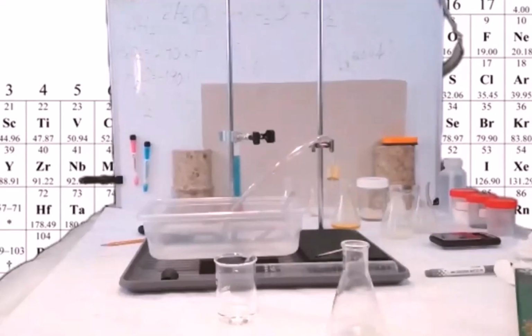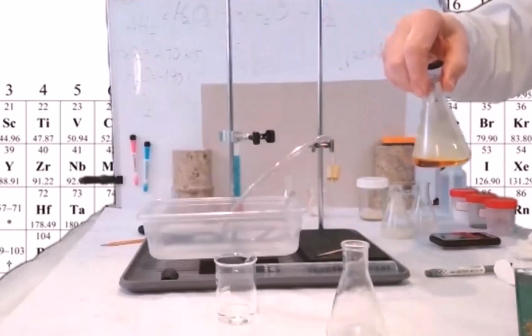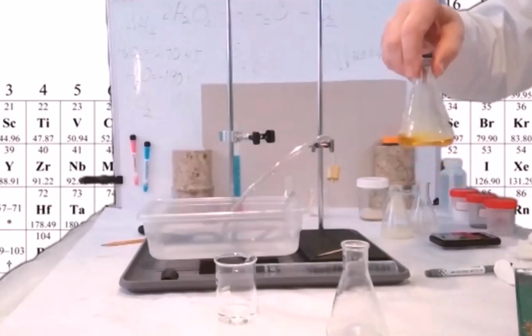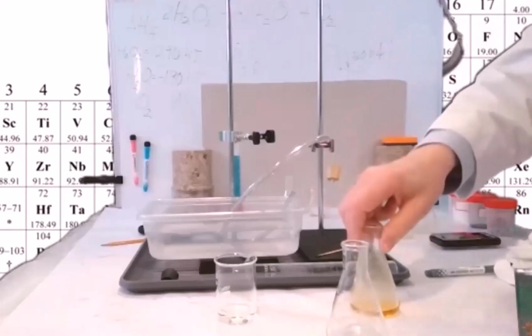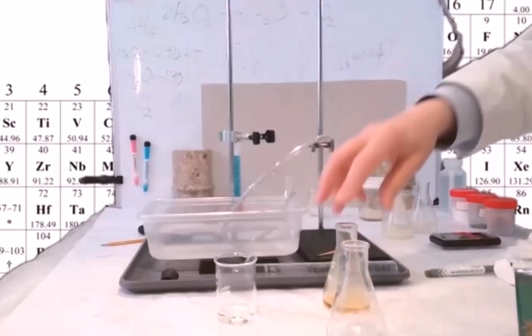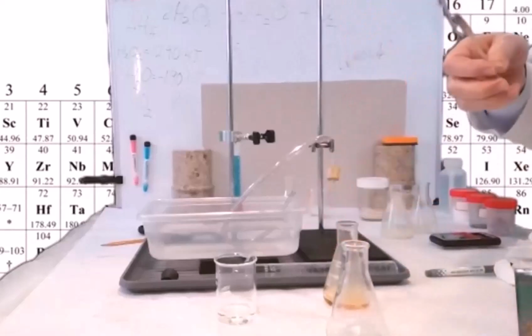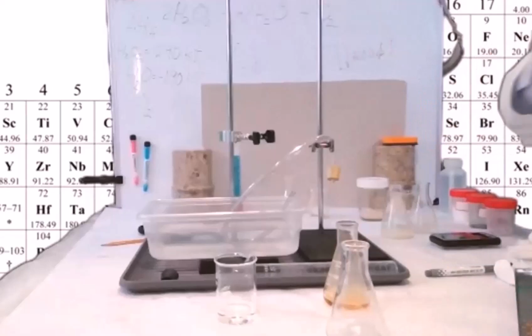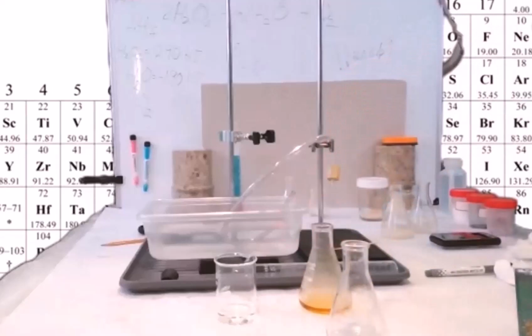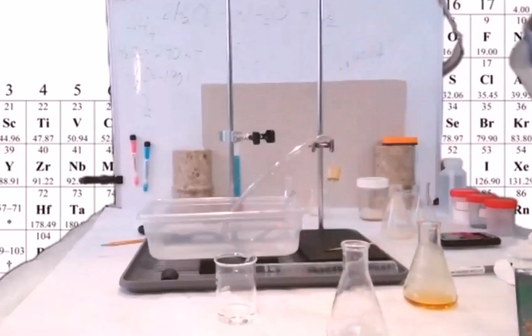When I had air in this flask, the partial pressure of oxygen probably was about 0.2 of an atmosphere. So when that splint was trying to glow, 4 out of 5 times it got some nitrogen. But in this flask, which had pure oxygen in it, all the collisions could have been with oxygen because the partial pressure of oxygen, this is pure, would be 1 atmosphere. And as a result, a glowing splint bursts into flame. So in a pure oxygen environment, if you've got something that's glowing, you're going to be in trouble because it's going to burst into flames. That's a measure of concentration again. Here, we're dealing with reaction rates, a faster reaction rate because of a higher concentration of the oxygen.